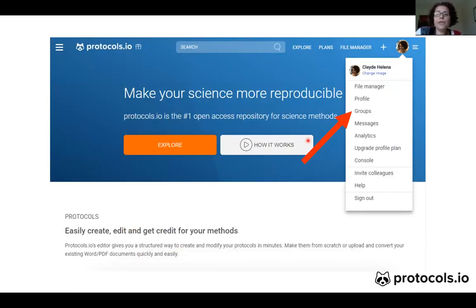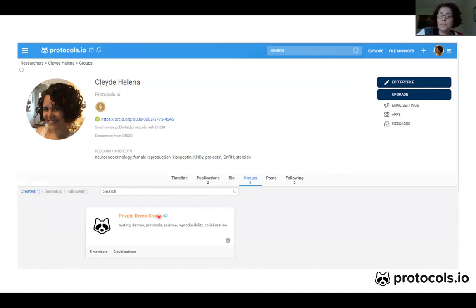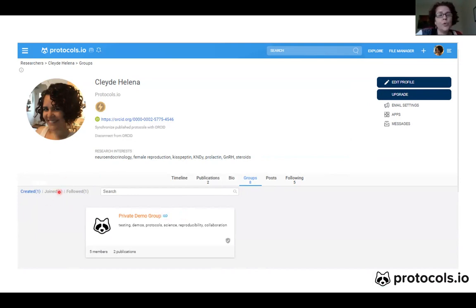After you create the group, you can click on your profile page and there is a drop-down menu where you can see Groups. Here is my profile interface where I can see all the groups that I am a member of. Among those, there is one that I created — this private demo group that we're using as an example today. There are others that I joined and others that I followed.